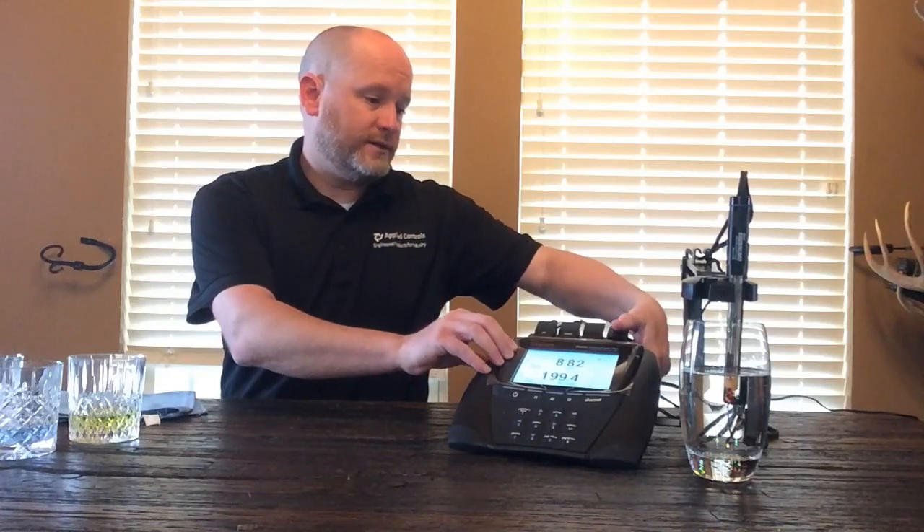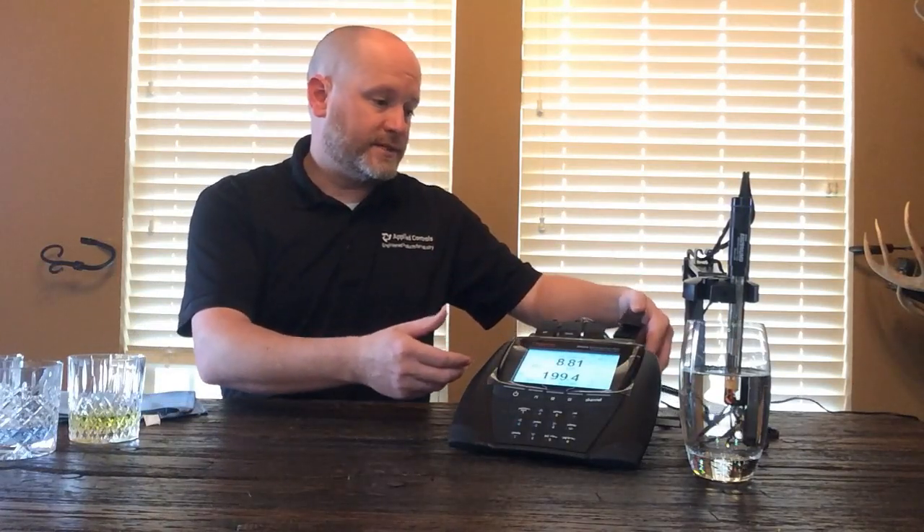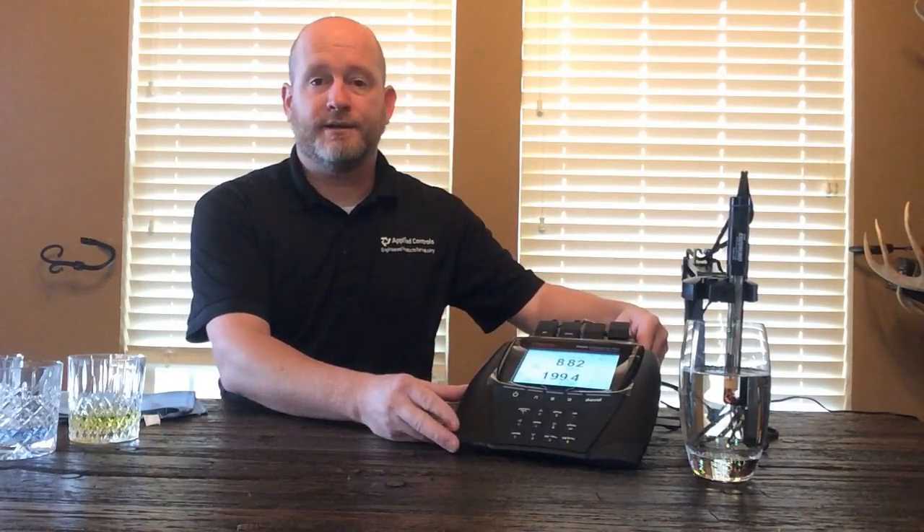It is modular, meaning you order whatever modules you need to get the readings that you want. This is a blank one, but for demonstration purposes today I've got pH and conductivity hooked up. You can have four pHs, four conductivities, you can do DO, RDO, it's got a pH/ISE if you need to do something like ammonia and so forth. A lot of different ways that you can measure, a lot of different measurement points to make.